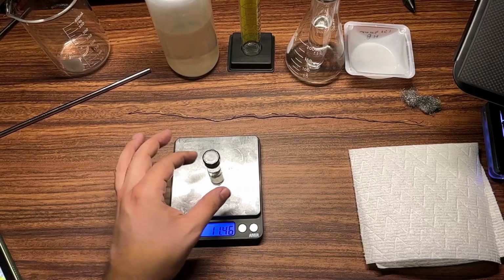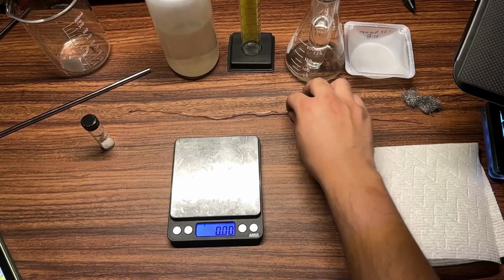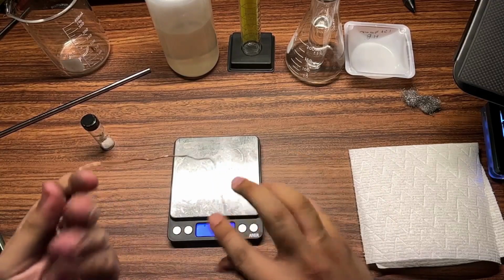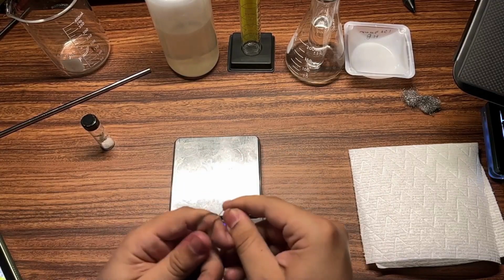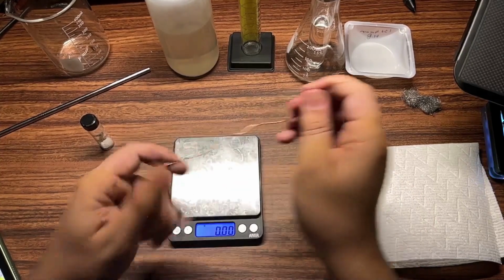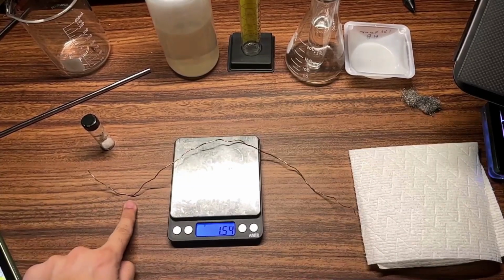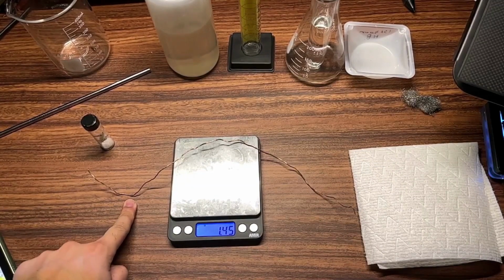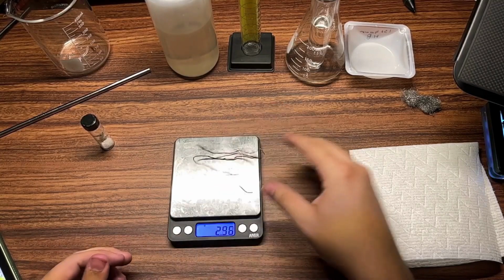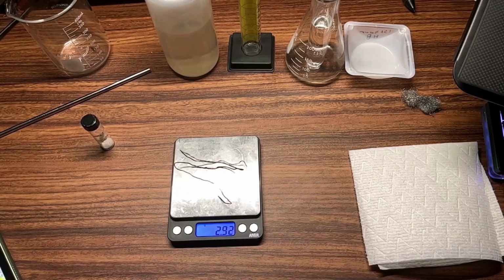Great. Okay, so next is to find the mass of the copper wire, because we need the mass of both of our reactants before the reaction happens. I'm going to sort of coil it up like this, just so it all fits on the balance, because I don't want it hanging off, because then there's a chance that it's touching the desk right here, and that's actually going to make the mass go down, right? So I don't want that. I want everything to be touching the balance. There we go, and we can see how big of a difference that was. 2.92 as your mass of copper.